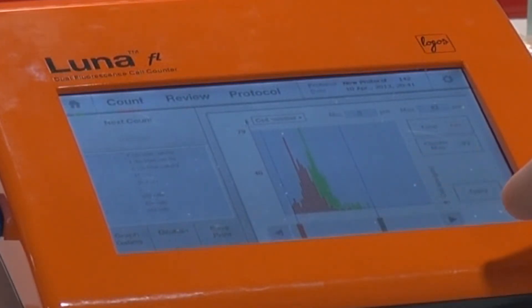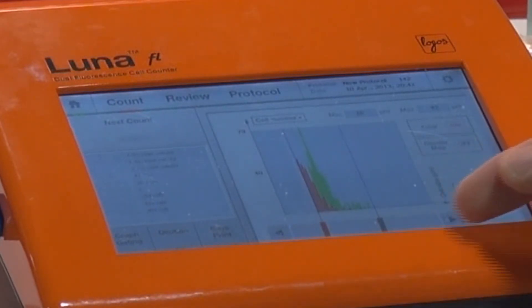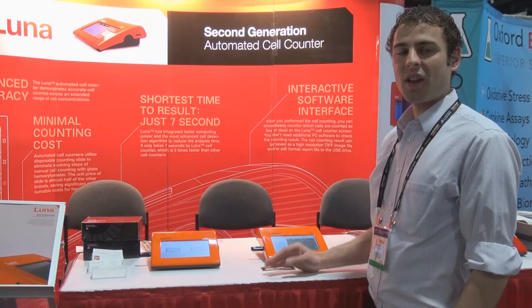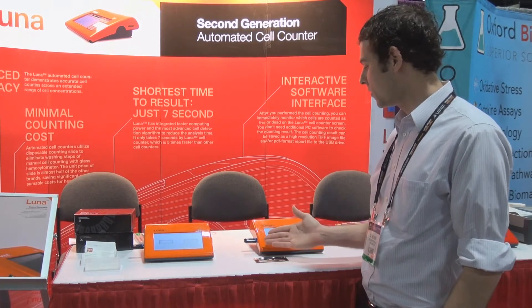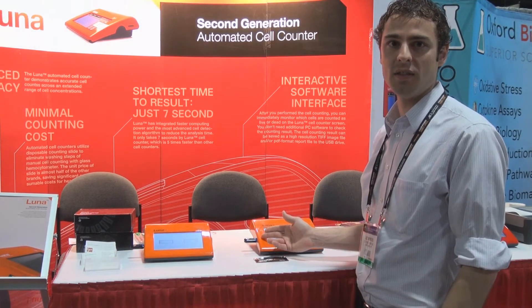You can furthermore analyze the data by toggling the gating function to hone in on a very specific region of your cells. After performing the count and any data analysis you choose, you may export your files to the computer using the USB port on the side of the Luna FL.